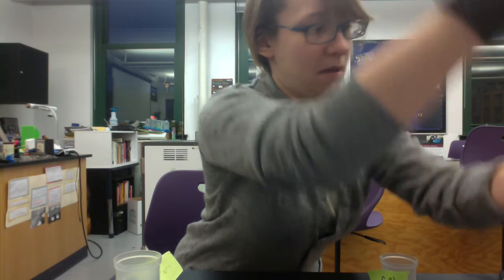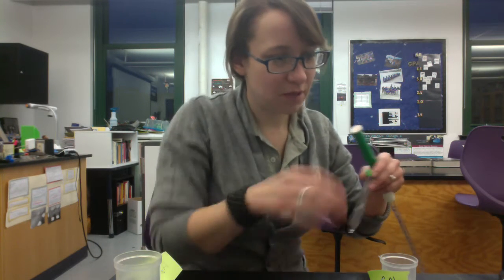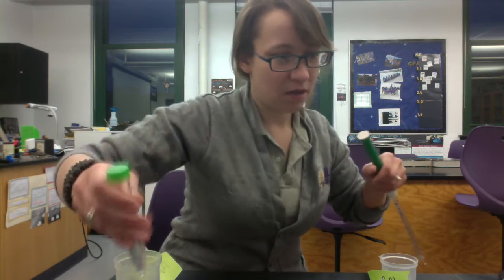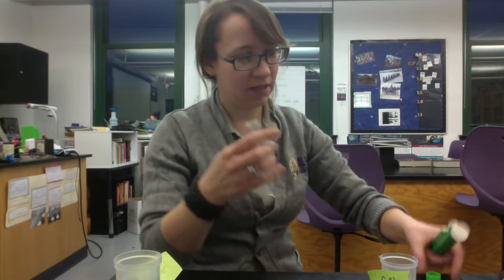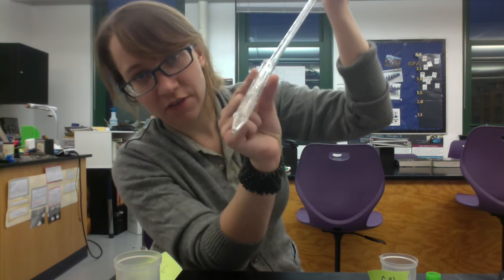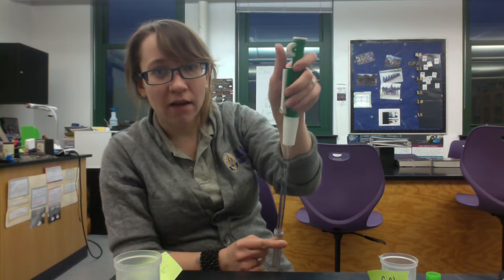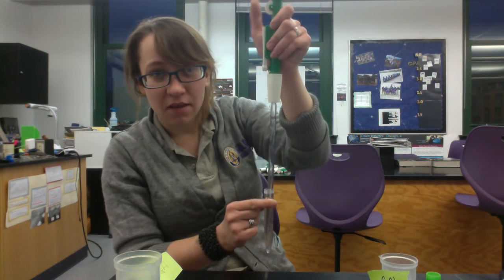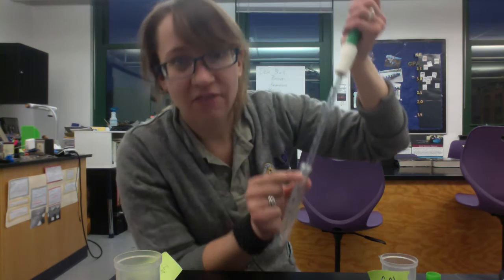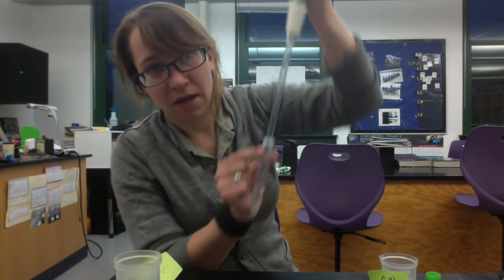I'm going to prepare my algae cells by drawing up three milliliters of sodium alginate. I'll put the tip of the pipette below the surface of the sodium alginate so that I don't draw air into the pipette, and I'm going to slowly roll back as I draw up the solution. The sodium alginate is very thick, so it comes up slowly — you have to be patient. Draw a little bit, wait for it to come up, and then draw a little bit more.